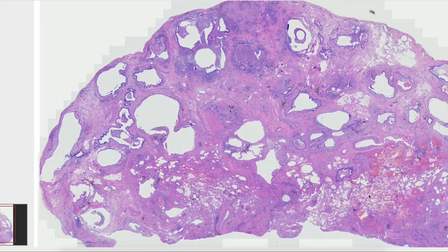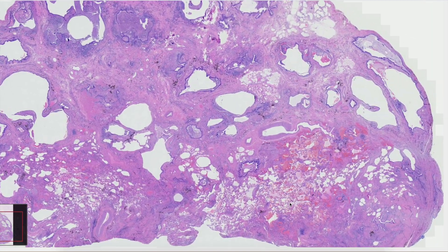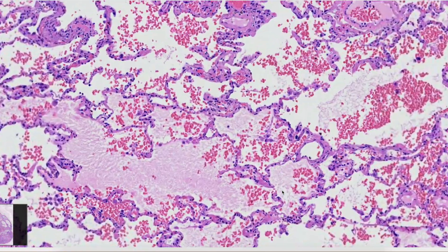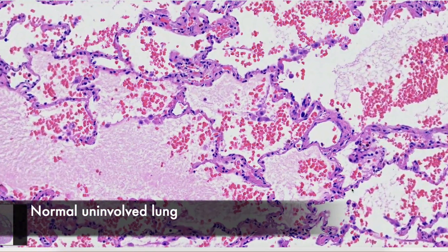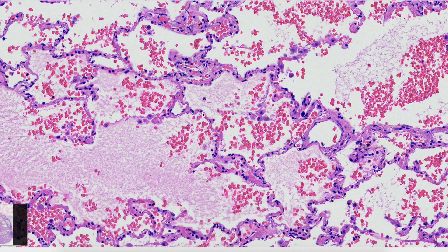Zooming into a bit higher power on the normal lung for comparison, we see architecturally normal lung with thin alveolar septae lined by pneumocytes and thin capillaries running through them. This is a site where efficient gas exchange happens.